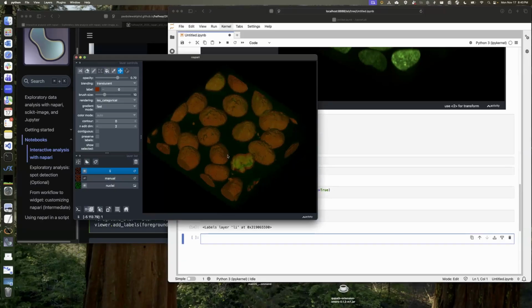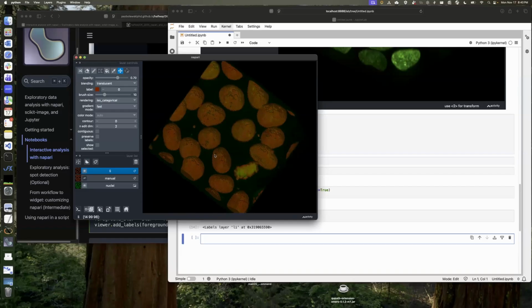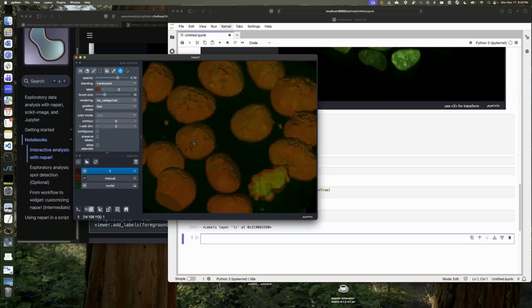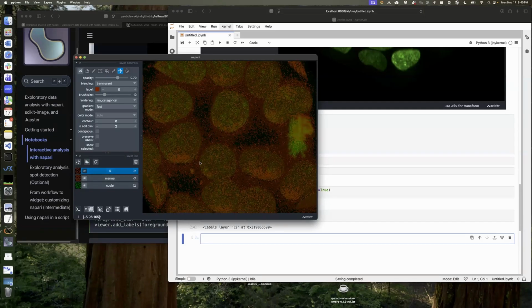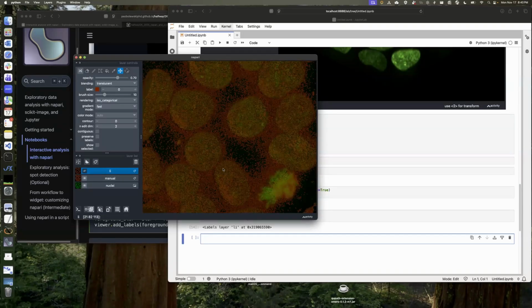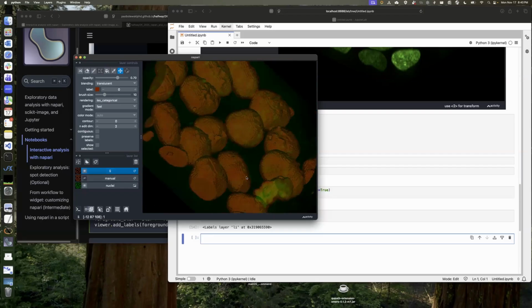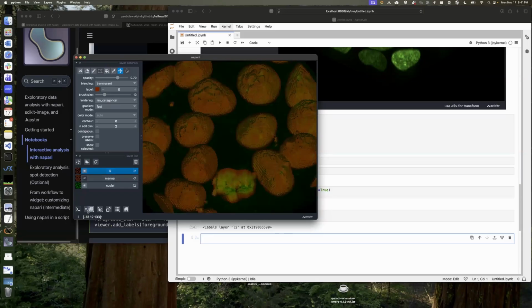So we can now compare the two layers. This is our blurred and automated threshold. Looks pretty decent. And then here is the non-blurred, naive, just manually picking a number. I think we can see pretty clearly that we have a pretty big improvement in terms of the overall segmentation.